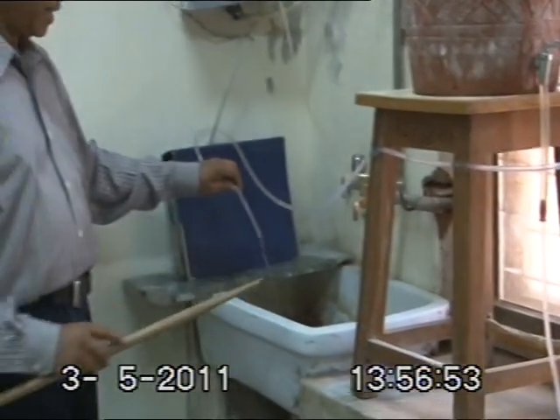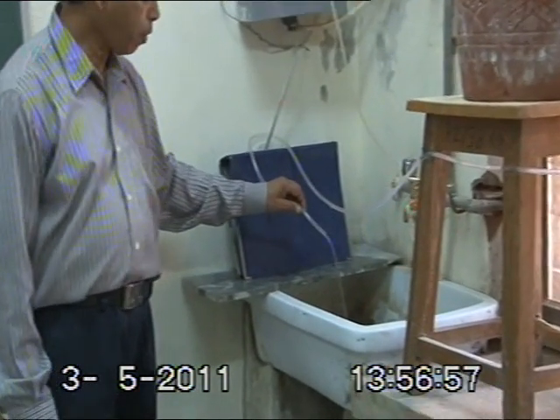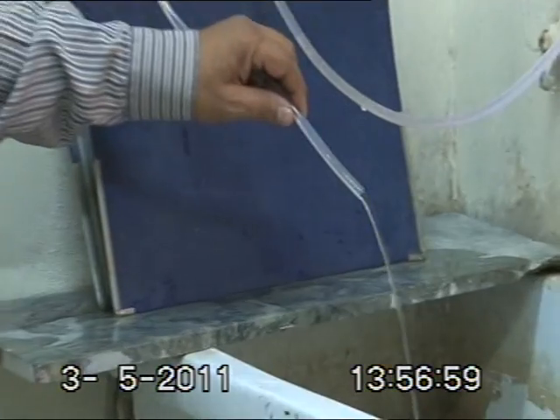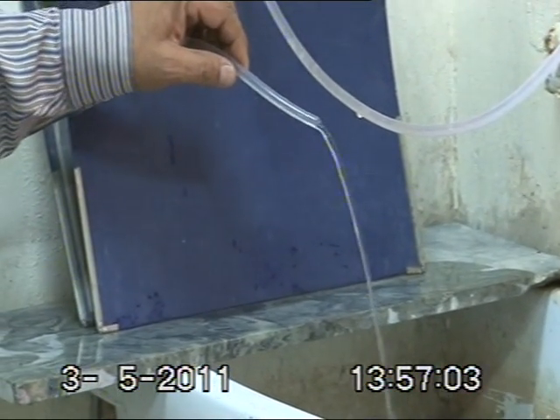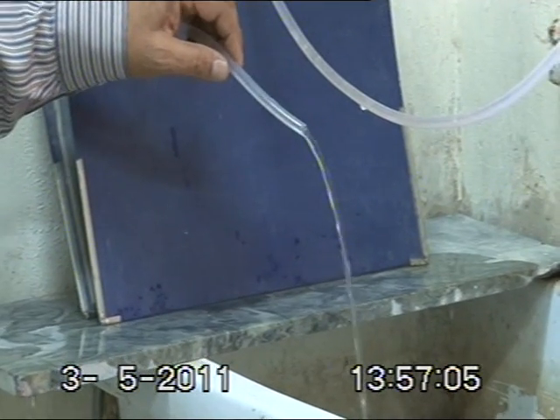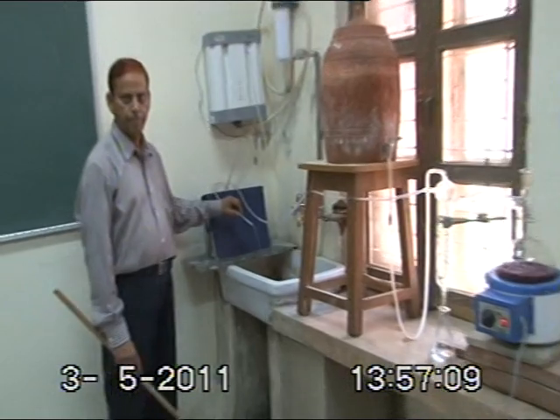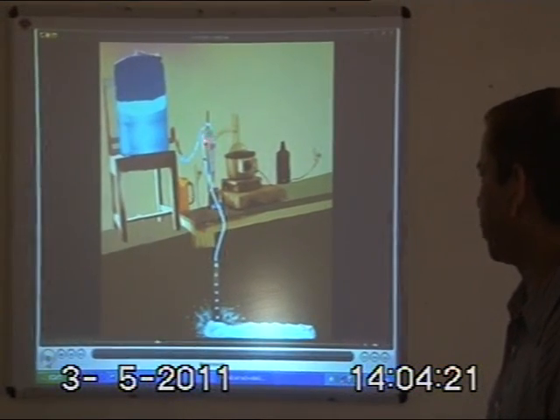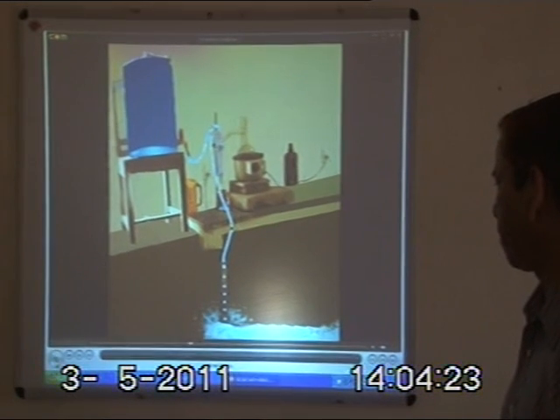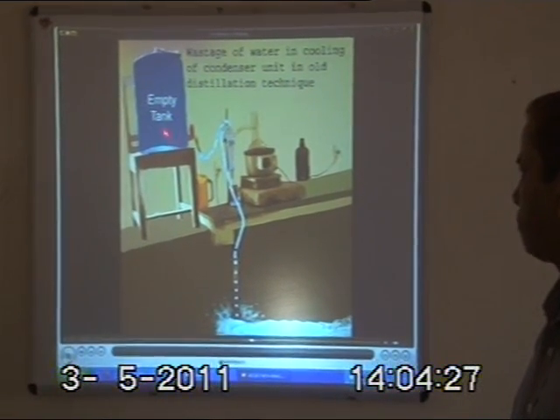Unfortunately, the water that is leaving the condenser tube is thrown in the drain pipe and there is no use of this water. Gallons of water are being wasted all over the world when using this old and traditional method. The water comes from the tank, enters the condenser tube, and leaves into the drain pipe. You can see a lot of water is wasted and the tank becomes empty.